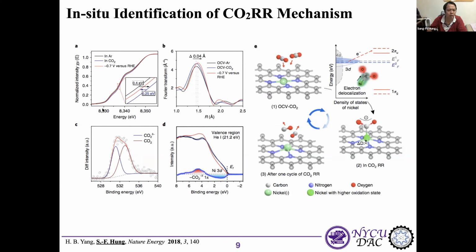Okay, so we compare the spectrum with the nickel standards. The edge shift is in the middle, between the pure metal and the nickel oxide.